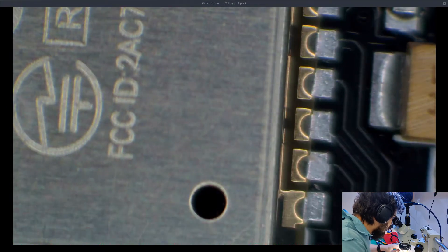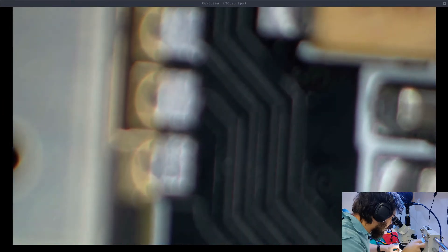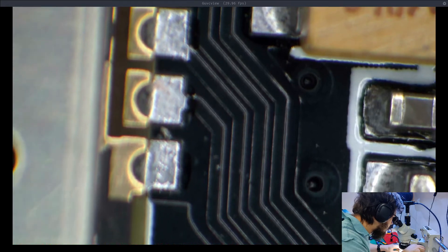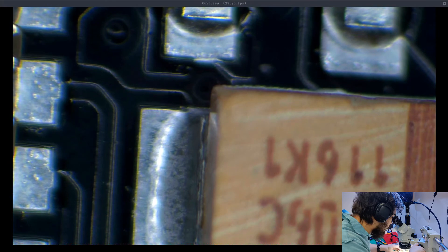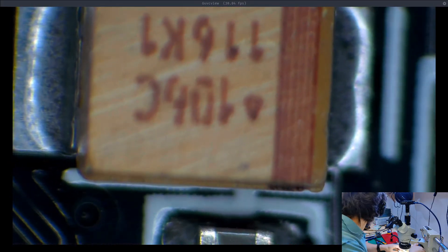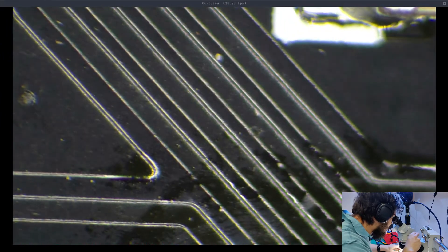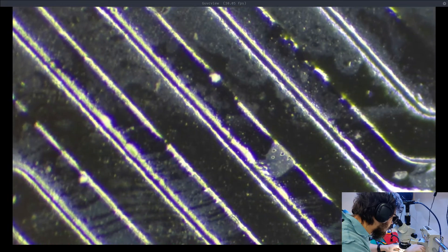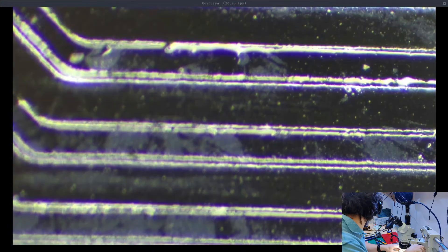Now I'm going to do a manual zoom, zooming with the microscope itself, and zoom in on just the top of that right there. Now I'm going to try zooming in all the way on these traces here. Yeah, pretty good — and that's with the microscope zoom, no digital zoom.